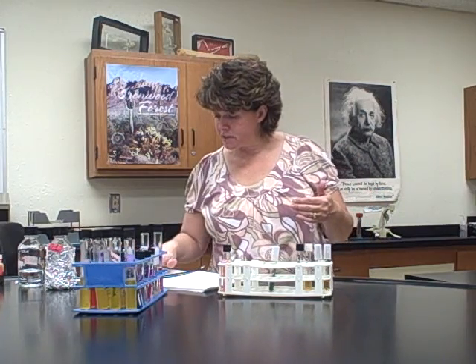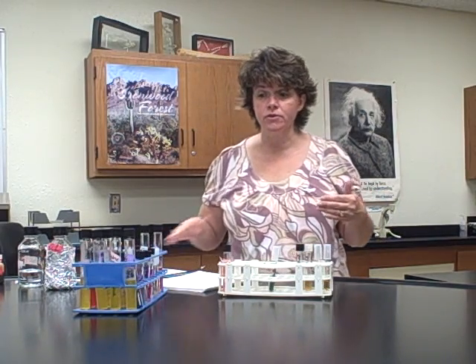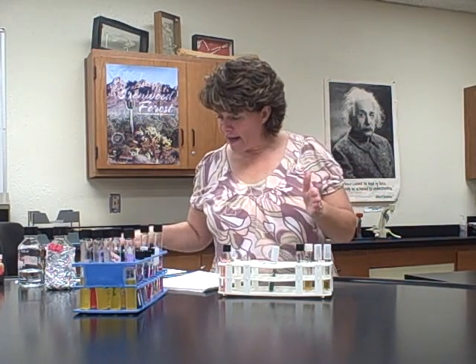In that table, it has the glucose, lactose, and sucrose. So you had put your bacteria into the 3 separate fermentation tubes. Then you'll fill that out, and then you'll go to another table that had a different bacteria or another group and fill out their information. Now, we had enough for 8 groups, so we had 2 groups doing each type of bacteria.